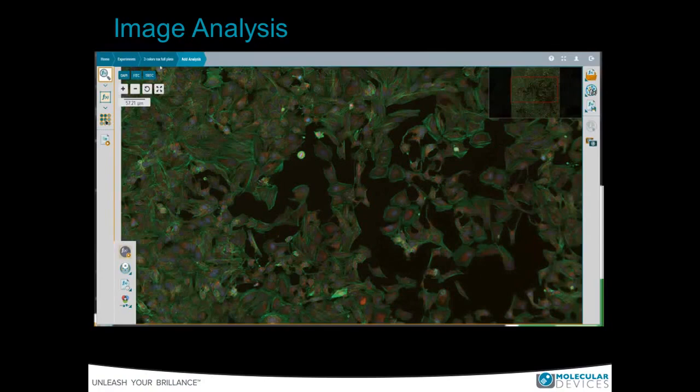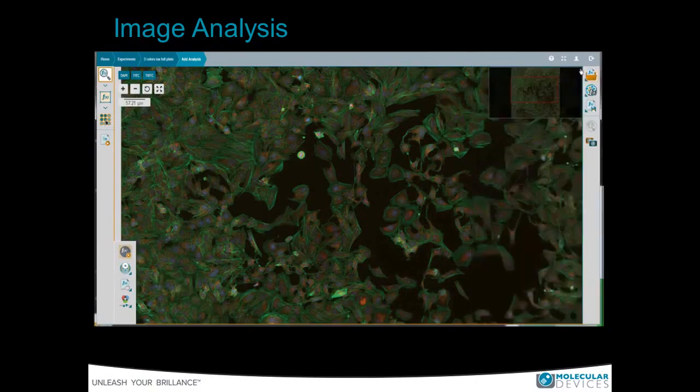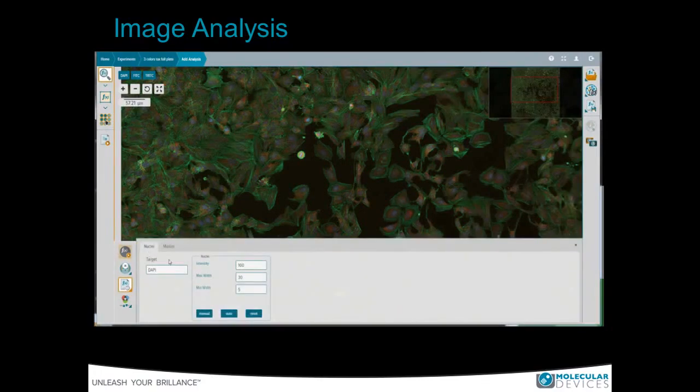For the analysis, you can select from a variety of available protocols. For example, select cell scoring analysis. Cell scoring analysis is based on finding nuclei, then scoring cells as positive or negative for the appropriate marker. Nuclei or cells are defined by dimensions, minimum and maximum, and also by intensity threshold over the background. You may start from the preselected numbers, or you can modify those by typing desired values.